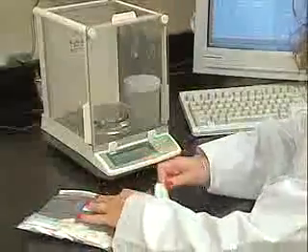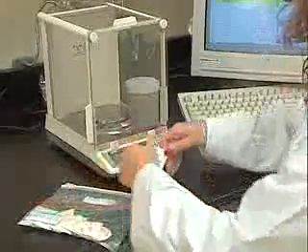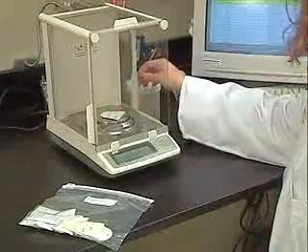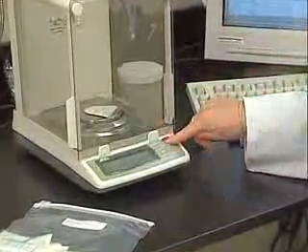With ANCOM filter bag technology, the process can include a moisture determination with little additional effort, so you can determine fat and moisture content with a single sample.